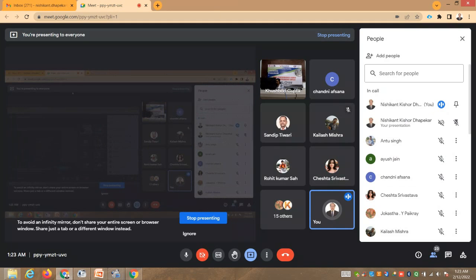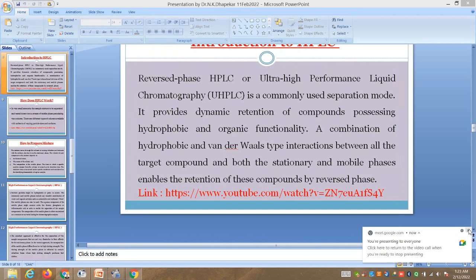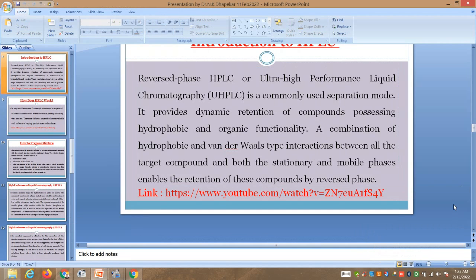So the important part is which molecule is your area of interest. How you will decide whether to go for reverse phase or normal phase HPLC depends upon your molecule of interest. The best example, which I have shown in this video for civil engineering participants, is that retarders basically contain sugar based molecules.